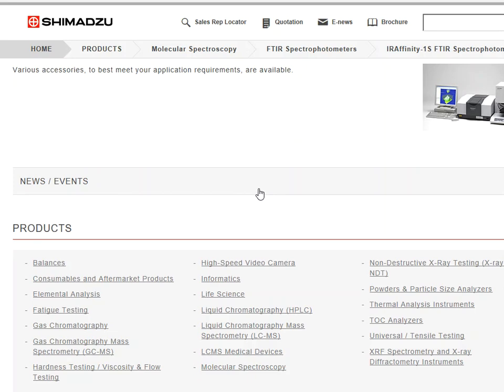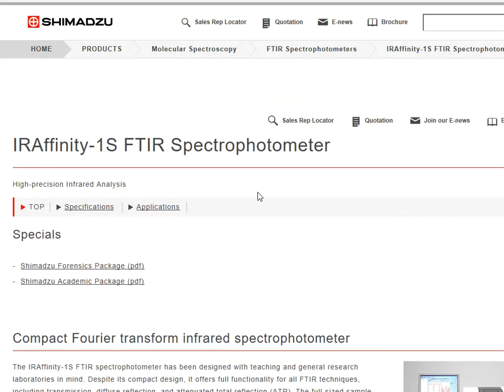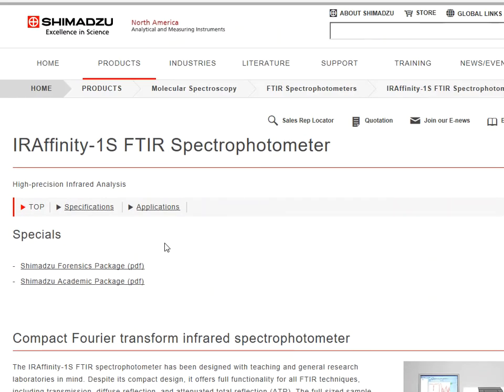All right. So there's all kinds of crazy attachments that you can add on to these. You can run gas samples if you want to, but that's very uncommon to do. But there are gas containers that you can trap a gas sample in and run them in FTIR, just as you can with maybe UV vis as well.